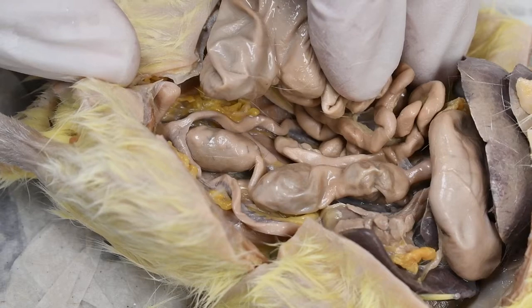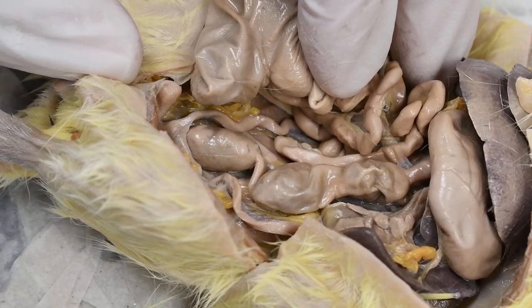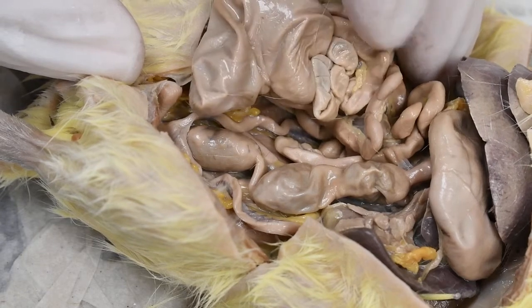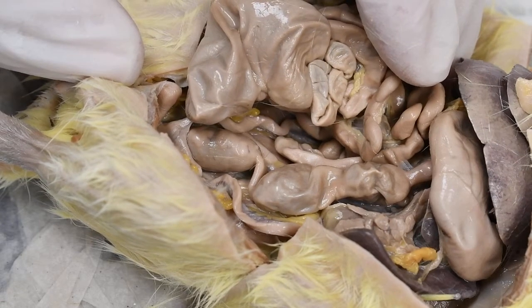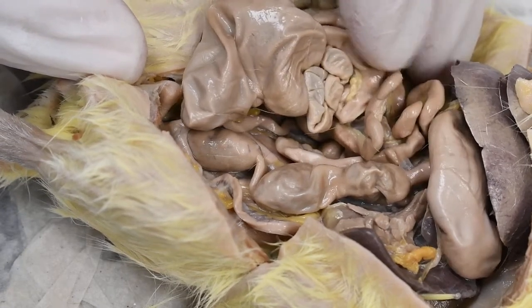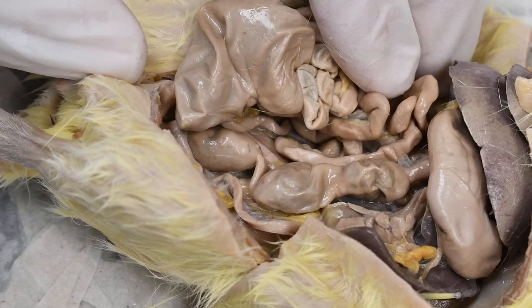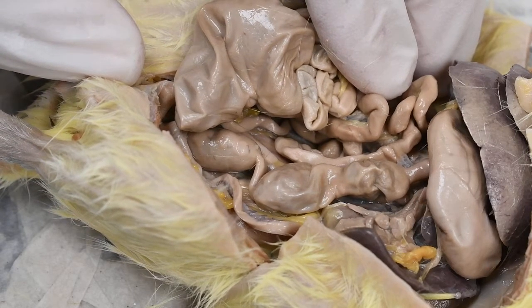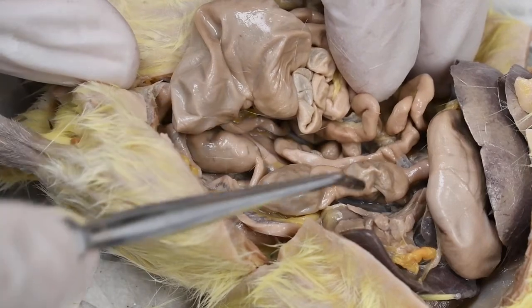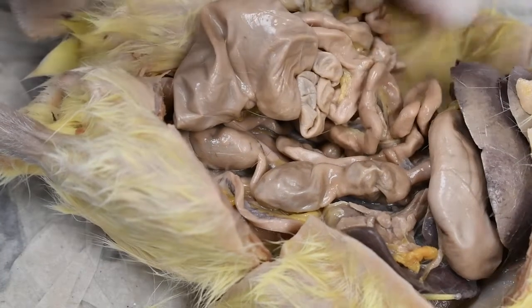All right, the function of the large intestine is primarily to remove water, whereas in the small intestine, it's mostly to finish digesting food and absorb food. So the small intestine usually uses quite a bit of water to affect digestion and absorption of food. So the function of the large intestine is then to remove all that.